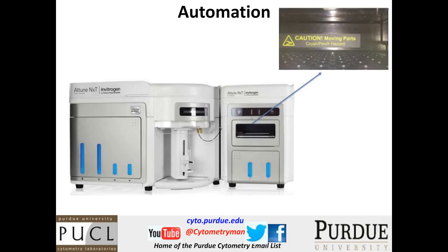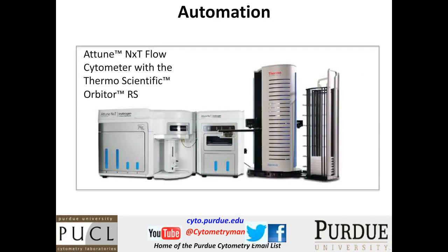So that's the first feature, but a feature that I haven't yet tested, but have seen in operation out in Eugene, Oregon at Thermo's site, is their automation system. What they've done is they've taken their orbiter system, which can grab a bunch of plates from here and pop them in here and then put them back.